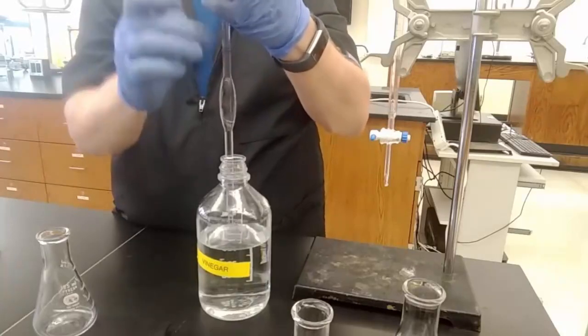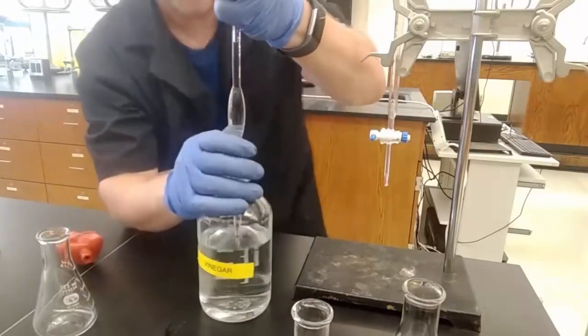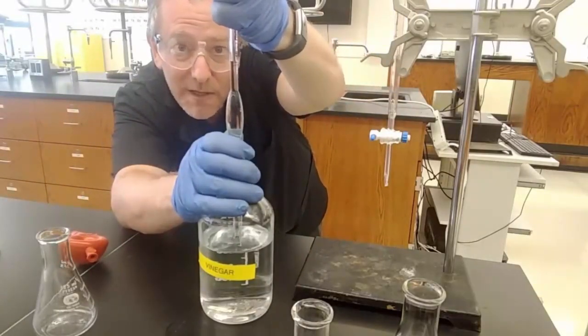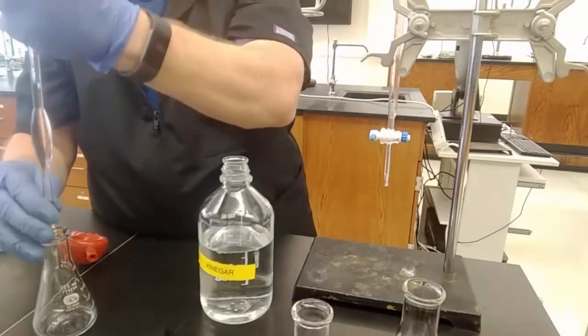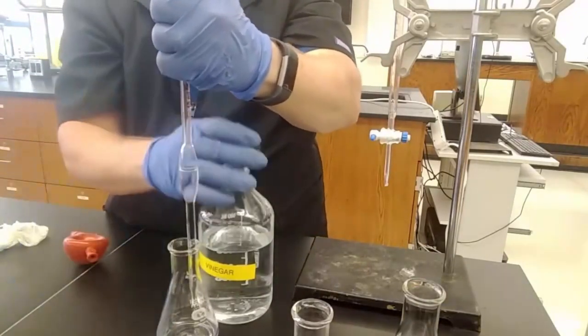And pass the line. If I got an air bubble or something in there, I would just let it drain out and start over again. Again, I get back down to eye level, rotate my thumb off very, very slightly. You can move the meniscus down incredibly slowly until it's exactly on the line. I'm done. Wipe off the outside just in case there's anything goofy going on and let it drain on its own into Erlenmeyer flask number three.